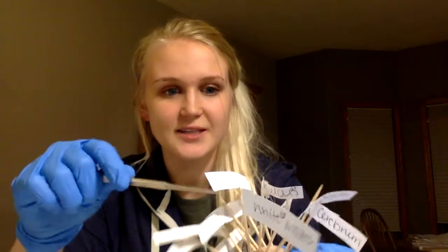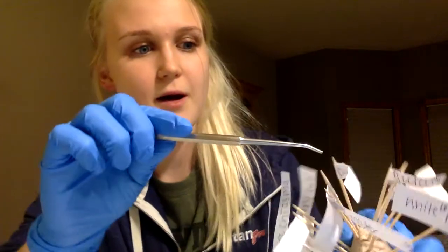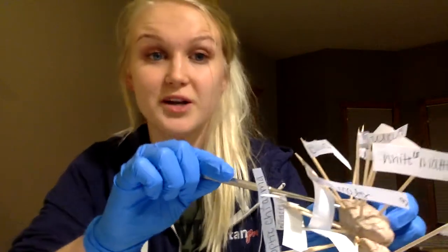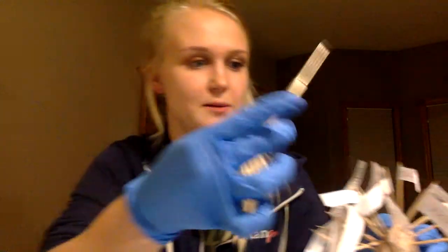First I will start with the meninges, and it was kind of difficult to remove these three layers on the brain that I received, so I'll just talk about them. They are basically protective layers that surround the brain and the spinal cord, and here is the outer, tougher connective tissue layer, which is known as the dura mater. The middle layer is known as the arachnoid mater, and the inner layer is known as the pia mater.